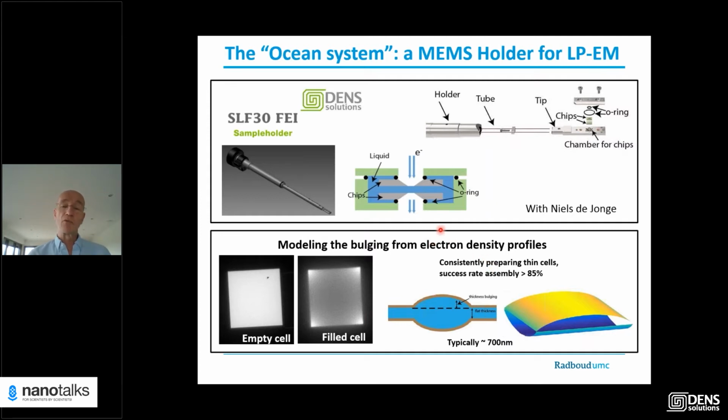We have been using this holder and we have been very happy with it, because for us the big benefit was that it allows the assembly of the cells with a very high degree of success, and it also allows us to control the bulging to make consistently cells that were thin enough to have good resolution.